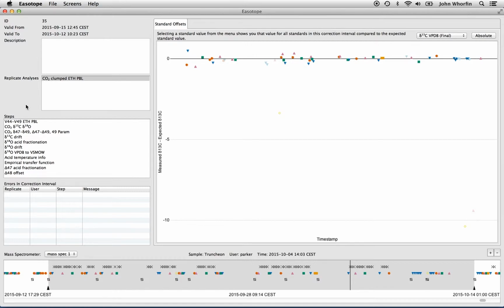So what you finally see when you look at your output, when you look at your results table, is a huge spreadsheet of all the numbers that were calculated by all these steps.